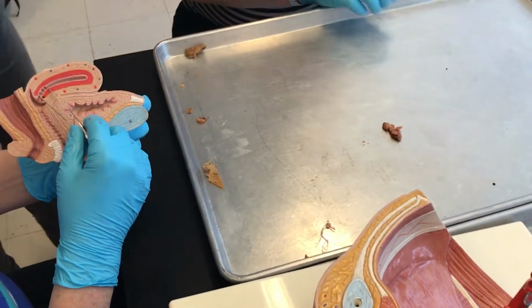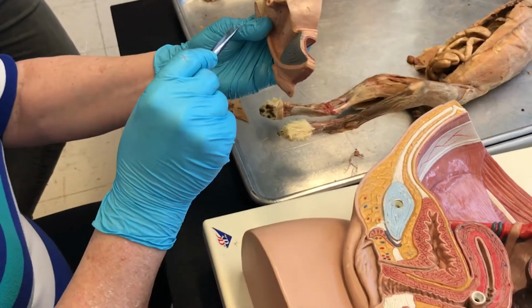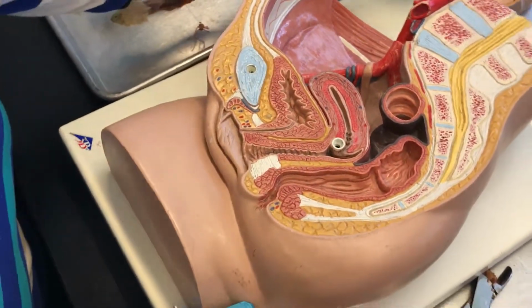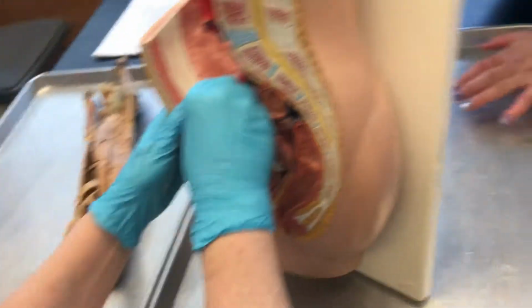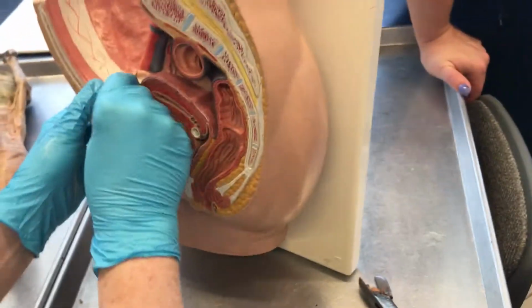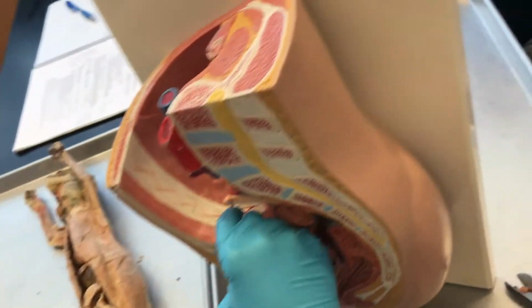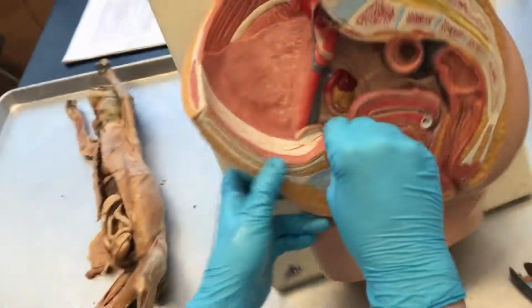Next, ligaments attach to the uterus, holding the uterus in place. So the round, broad, and ovarian ligament. To get the round ligament, we're going to go right to where the male had his testes descend. In the female, you have a round ligament holding the uterus forward right at that same spot. So that comes out, goes down. This would be a scrotum in a male down here. And it attaches through there to hold the uterus forward. Round.